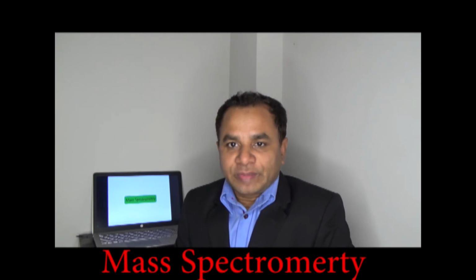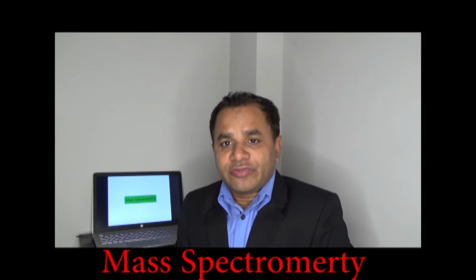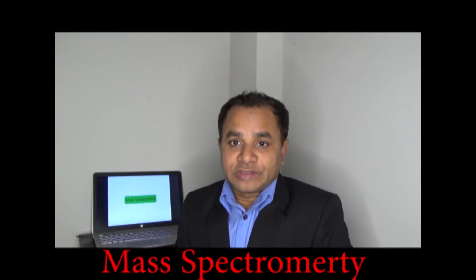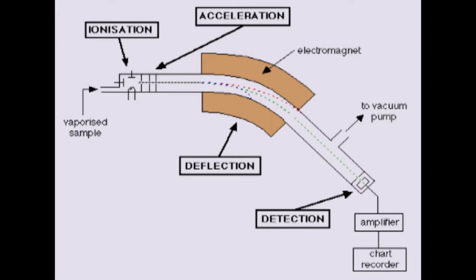Mass spectrometry is an analytical technique. This is used for many high-tech purposes. In this video, I want to discuss how to find out different isomers of organic molecules using the technique mass spectrometry. The device mass spectrometer has 4 different stages: ionization, acceleration, deflection, and detection.